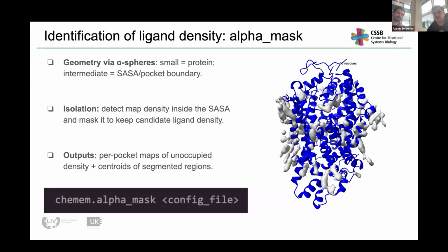Oh, okay. This probably is going back to the introduction slide. So, in the lab, we work on integrative methods, but the two methods we just discussed are really aimed just at CryoEM data. But certainly adding in additional restraints is something that we're very interested in. So these could be harmonic restraints or some other kind of positional or relative position restraint. But it's not something we currently support in TEMPy-ReFF or ChemEM.